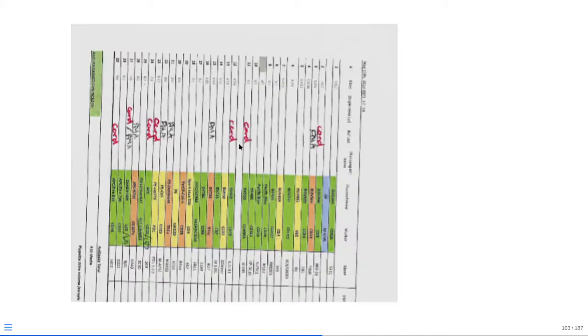We can also see what was prepared with the PMA activated conditions for those cases of the cytokine, and you can see there's a couple conditions where maybe both were used. So in this case, you can backtrack them accordingly, but as you can see, it's going to be a little bit messy when it comes to editing this negative column so that it matches the correct background that needs to be extracted from the positive signal.